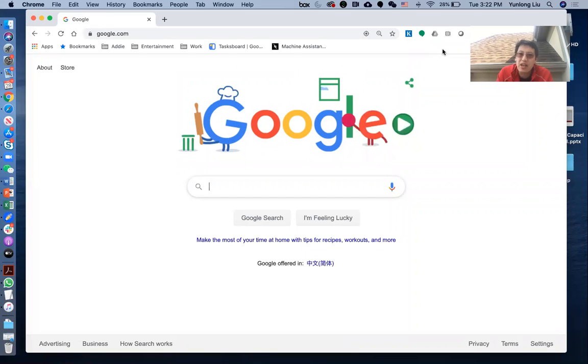Hi, this is Dr. Yunlong Liu, and this is the second video talking about how to visualize your own data using the UCSC Genome Browser.